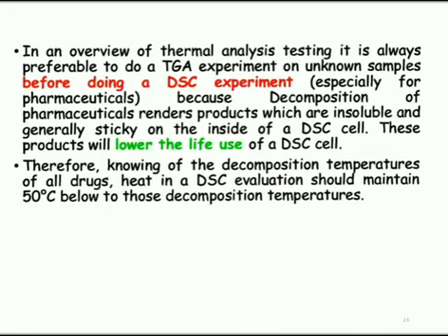And then, in an overview of thermal analysis testing, it is always preferable to run a TGA experiment on unknown samples before doing a differential scanning calorimetry experiment, especially for pharmaceuticals, because decomposition of pharmaceuticals renders products which are insoluble and generally sticky on the inside of a DSC cell.